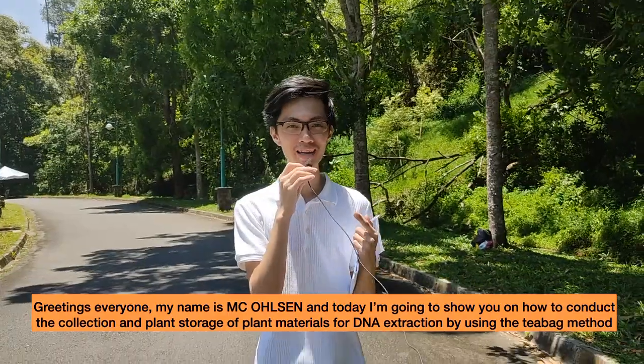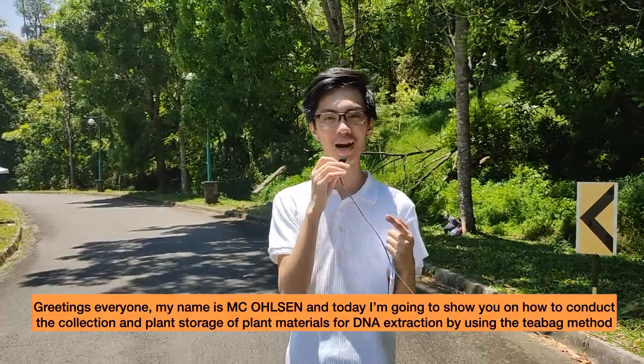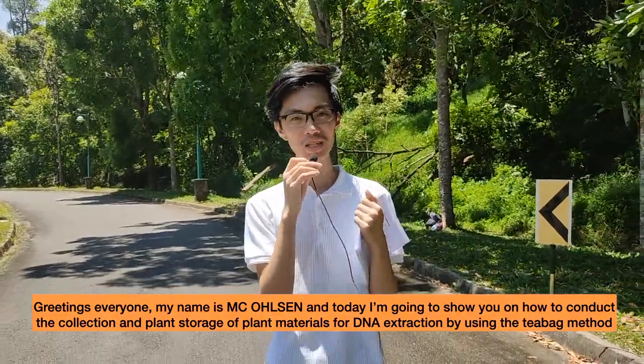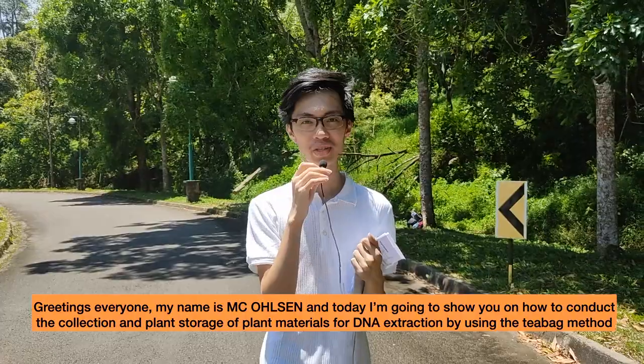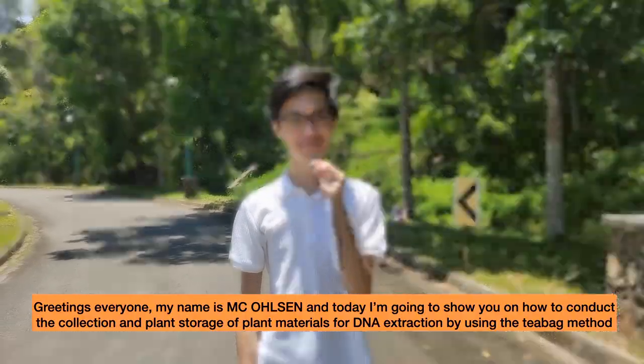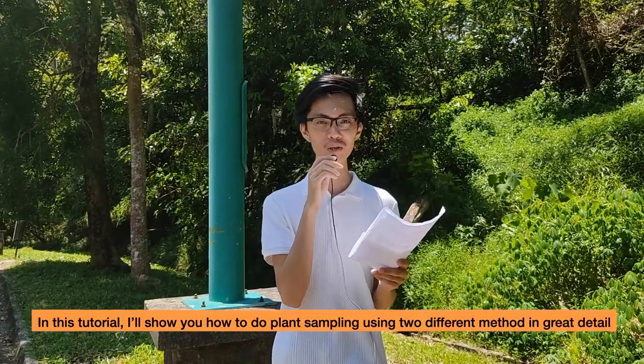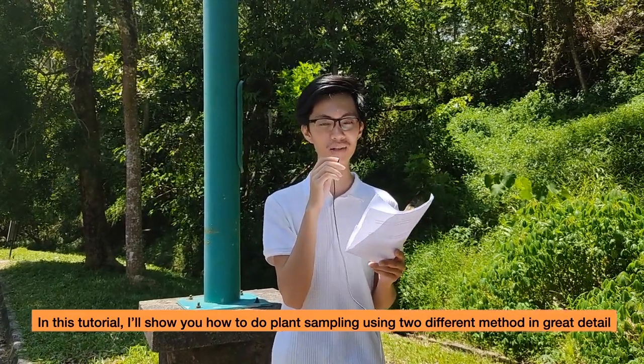Greetings everyone, my name is Mikkelson and today I'm going to teach you how to conduct the collection and storage of plant materials for DNA extraction using the teabag method. In this tutorial, I'll show you how to do plant sampling using two different protocols in great detail.